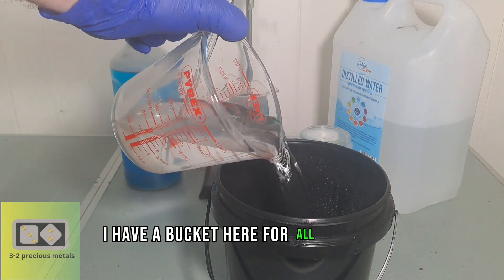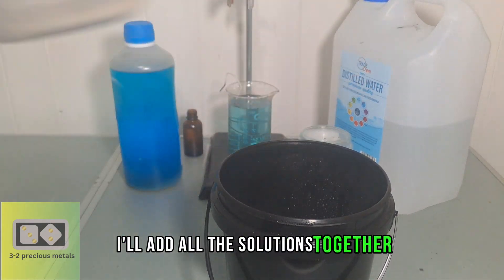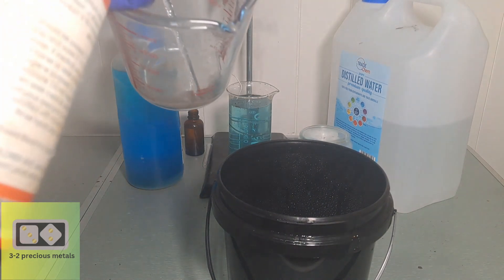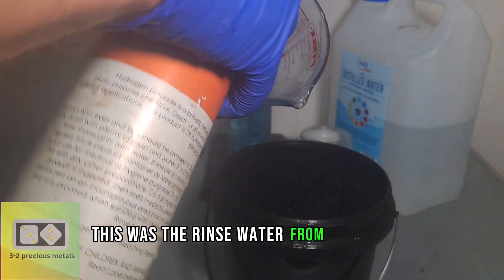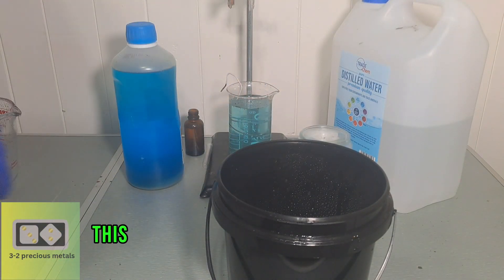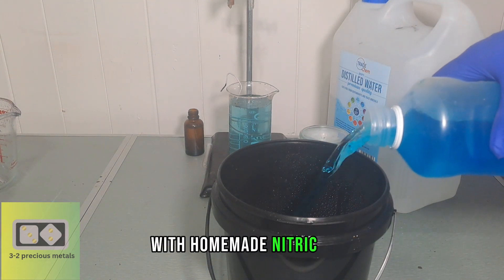I have a bucket here for all the other solutions. I'll add all the solutions together and drop the silver out as silver chloride. This was the rinse water from the silver crystals in the last video, and this was the rinse water from my silver refining video with homemade nitric acid.